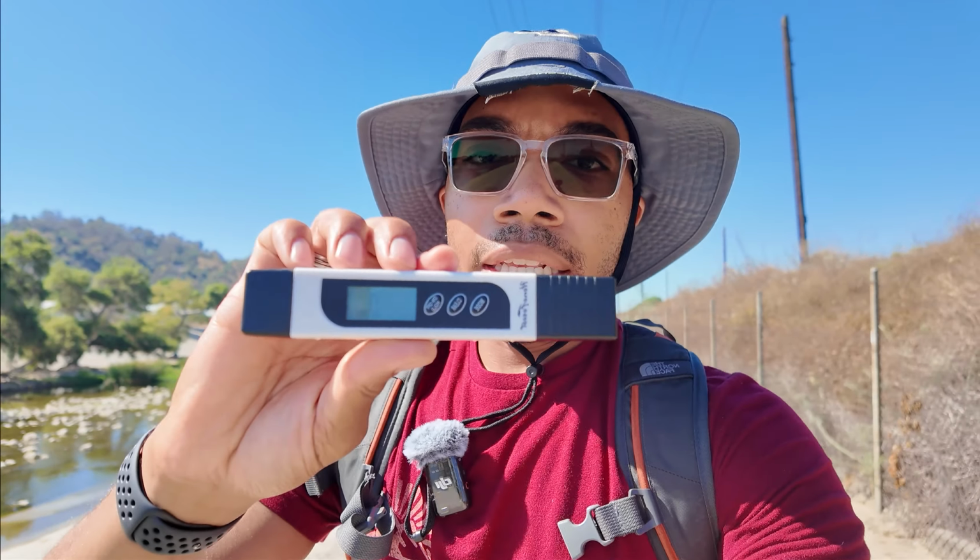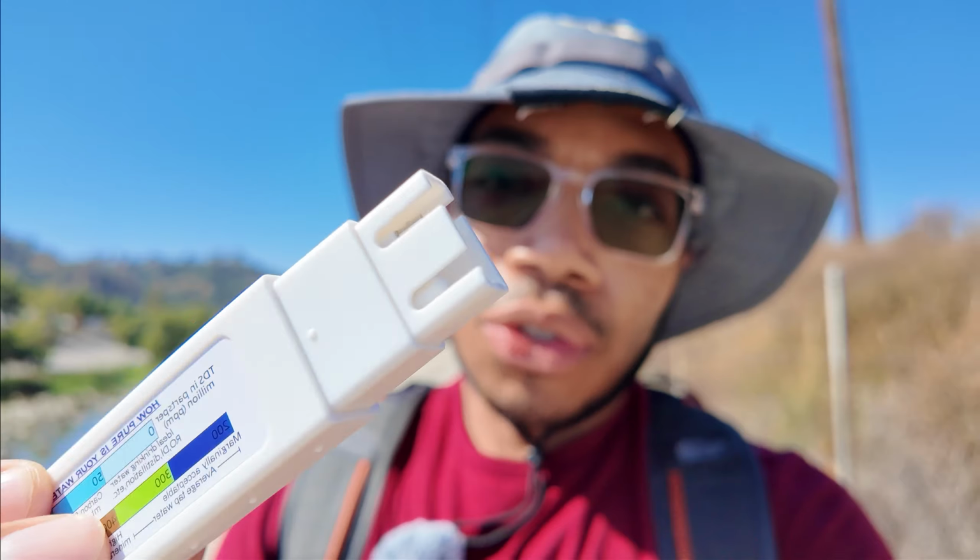This is the probe. It's fairly simple, pretty straightforward. There are 3 buttons: on, clear, and mode. If I open up the actual testing side, you can see there isn't much to it. There are 2 prongs in there, and as long as we have water that connects those 2, we can get a conductivity measurement. And so in a moment, I will be down by the river and we'll start taking some water samples.